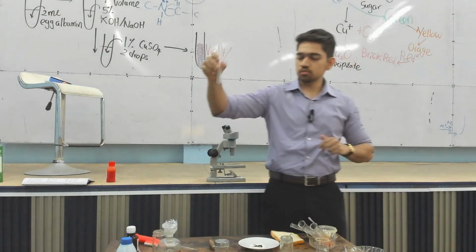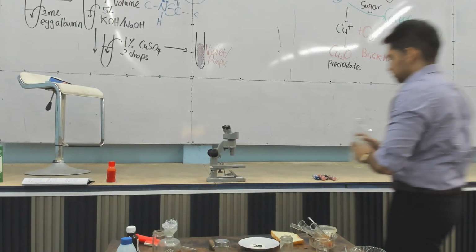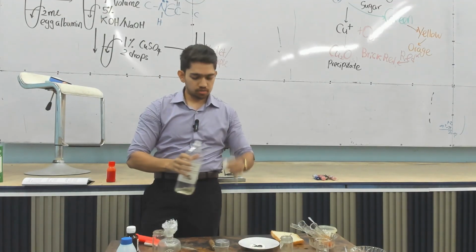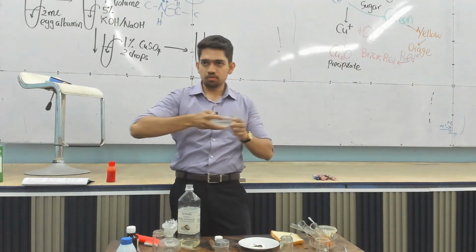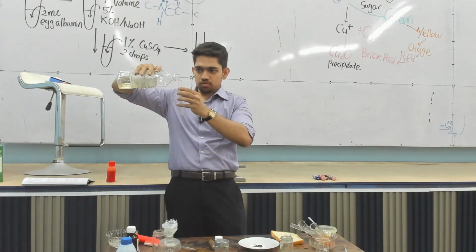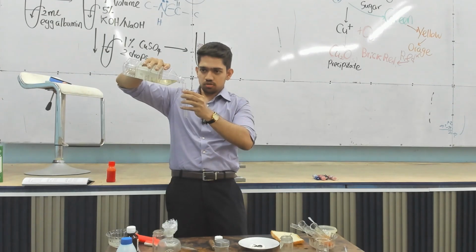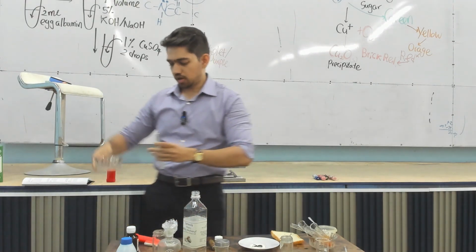So what we can do is, to a test tube, you can add some pure coconut oil, right? Mother's coconut oil, okay. So let's make a sort of a double layered structure, right? We'll add the coconut oil first just to see what's going to happen. We'll add a few drops of coconut oil. Okay. Then to that we'll add some water.